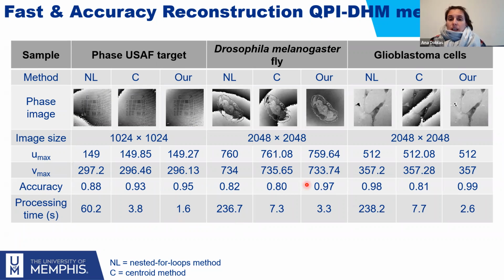They give us different values. If you see the values, there is not a huge difference between them, but still it's a pretty good difference, and that's what makes the results so different and our method more accurate. For the accuracy, we estimate it based on how many pixels are equal to 1 in the binary image and how many pixels are not.